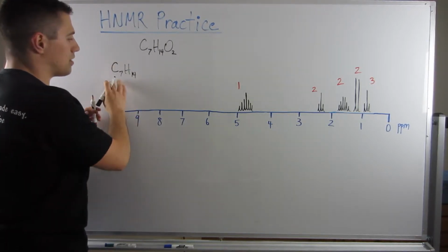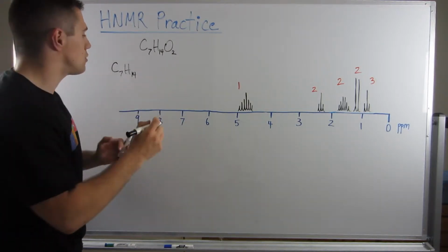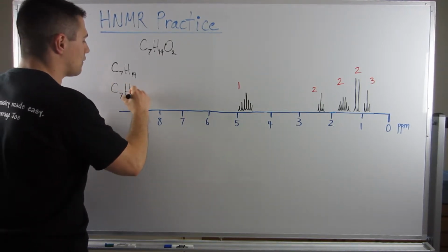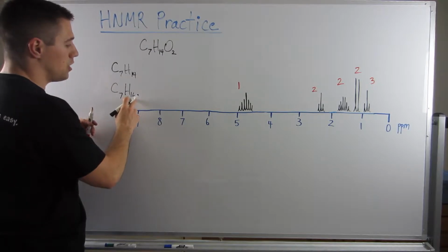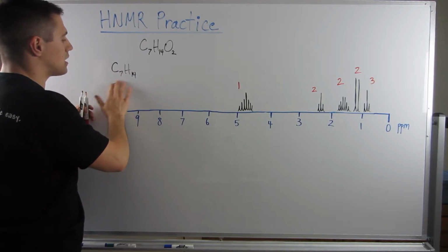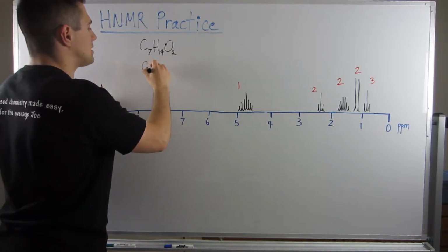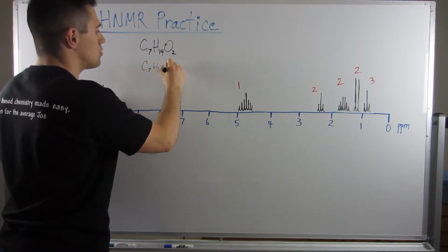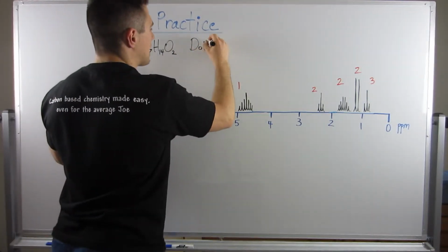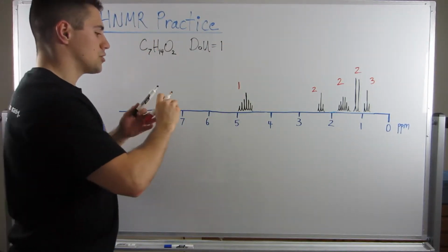I would compare this to what this 7-carbon alkane, or 7-carbon hydrocarbon, should have as far as hydrogens if it was completely saturated. So usually, if I have 7 carbons, this is my N. My 2N plus 2 would be 16. So you see, I'm 2 hydrogens short, and I know a degree of unsaturation gets rid of 2 hydrogens. So right here, I can tell because I'm not C7H16O2, I actually have 1 degree of unsaturation because I'm missing 2 hydrogens from my completely saturated form. Okay, so this is important.